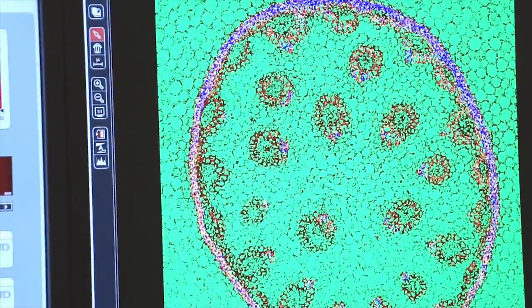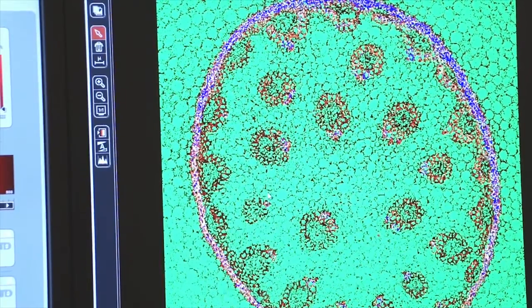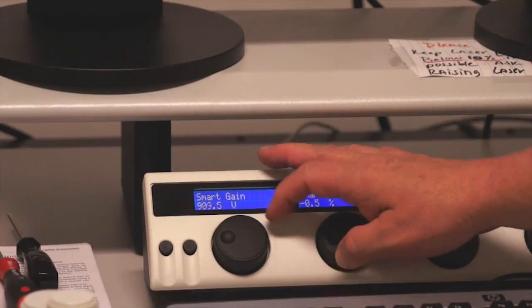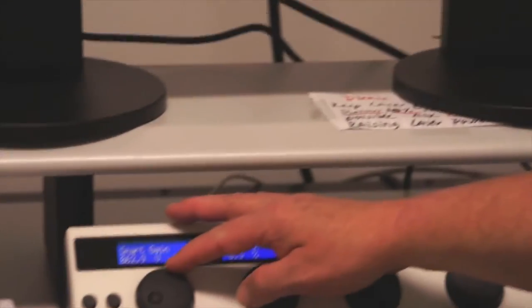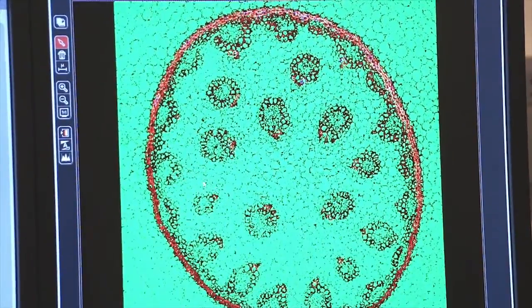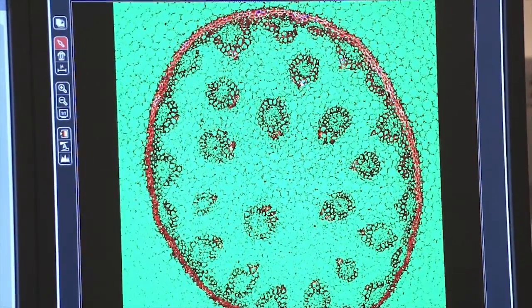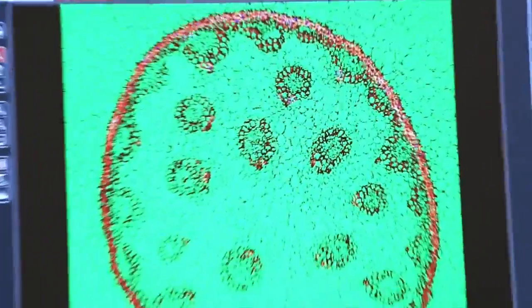Your gain control will change the number of blue pixels in your image and you want to turn the gain down until you have only a few blue pixels. As you can see here, at about 891, I'm starting to see a few blue pixels in my image. That's the proper setting for my gain.